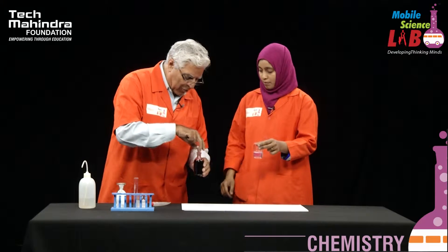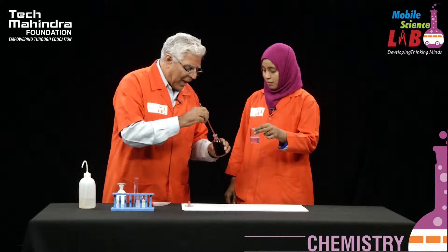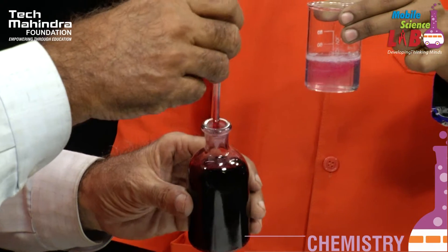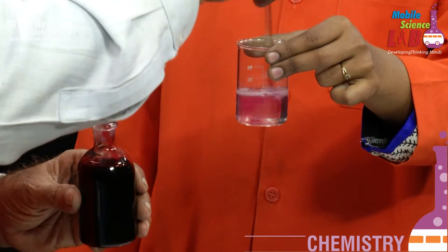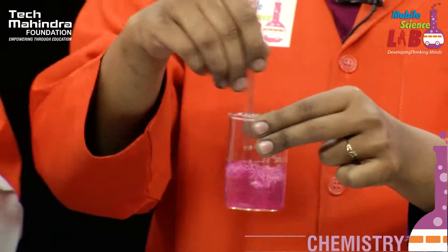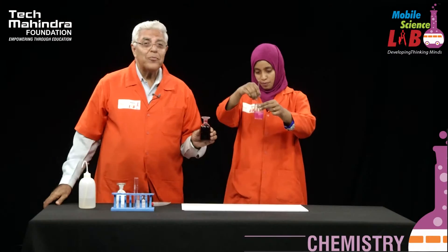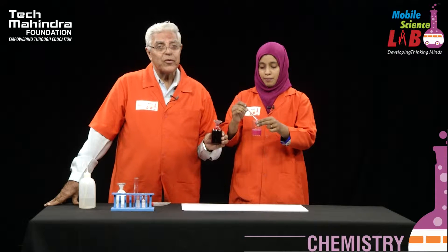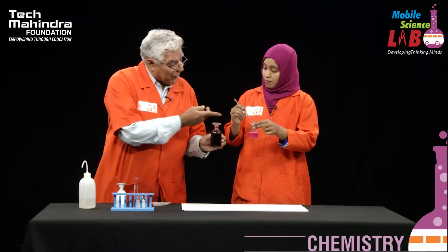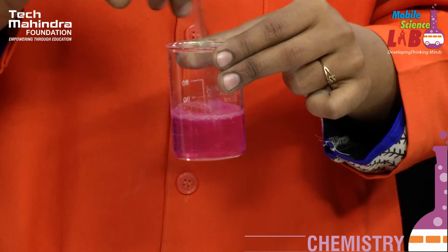That colour doesn't seem to be so uniformly dispersed, so I will dip my glass rod into the solution and mix it. This, students, is a solution of a dye called safranin, used very much by biology colleagues for staining specimens for the microscope. After mixing, as you can see, we've got a beautiful pink colour. We have taken two tubes of this synthetic adhesive.